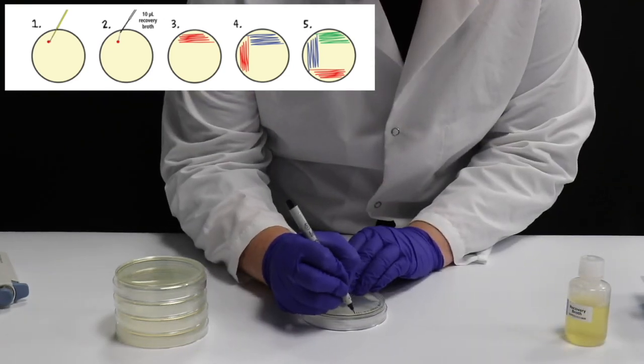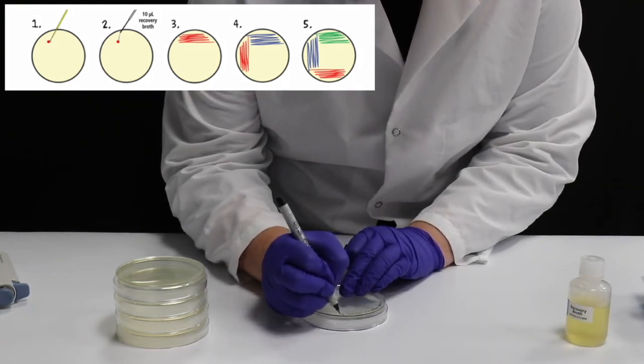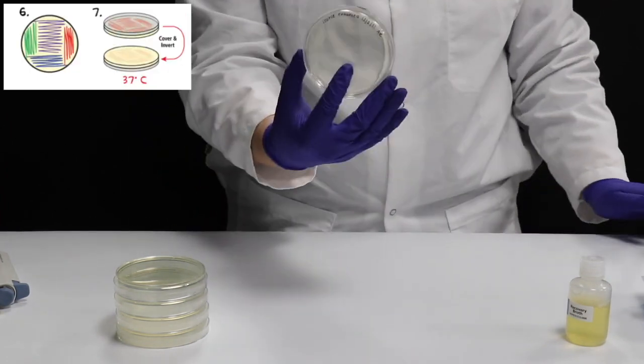Label and cover the plates. Incubate inverted at 37 degrees Celsius for 18 to 22 hours.